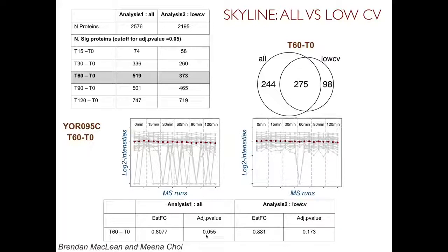So this p-value is borderline, right? If suddenly you use the false discovery cutoff of 0.1 instead of 0.05, you can actually see this as differentially abundant. But this is what happens here, right? If we just look at the individual features, we see that this type of filtering actually eliminated a lot of the things which we don't want to have, right?